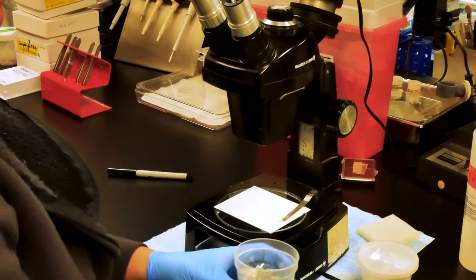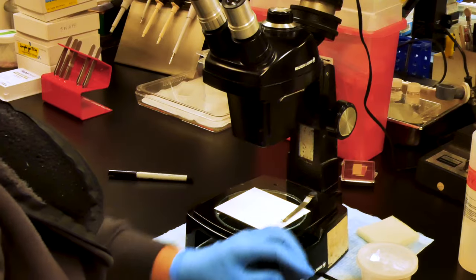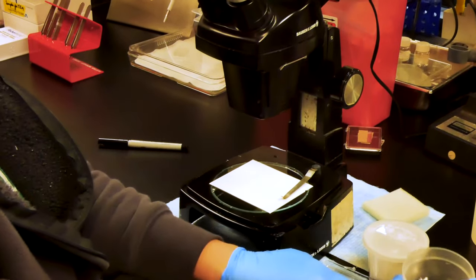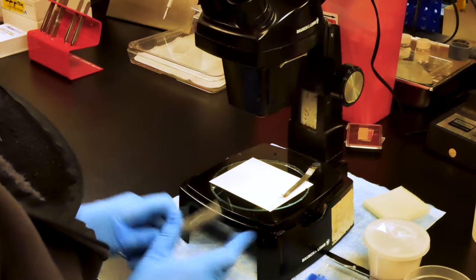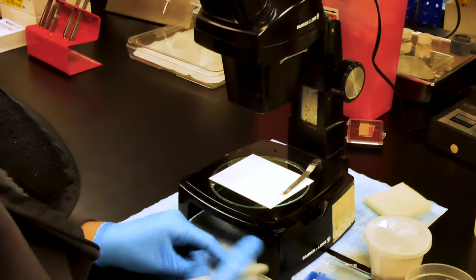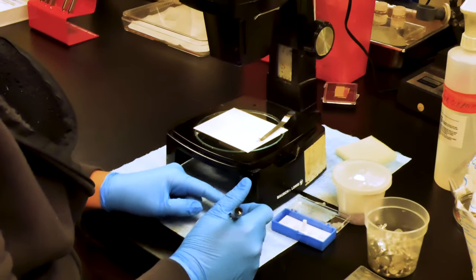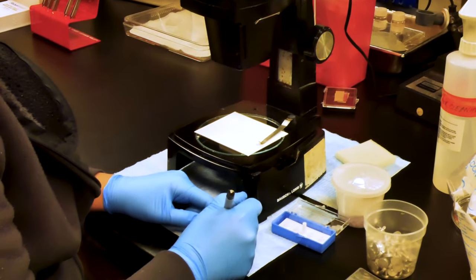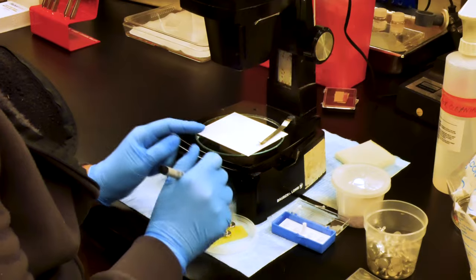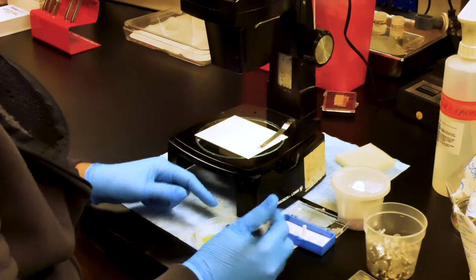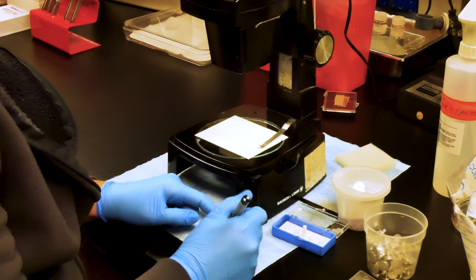With gloved hands, we will remove the number of stubs that we need. Today we need two. We will label the underside of the stub with the specimen name. This is a very important step. If you forget, then if your stubs were to get out of order after you've mounted your sample, it would become very difficult to determine which is which.